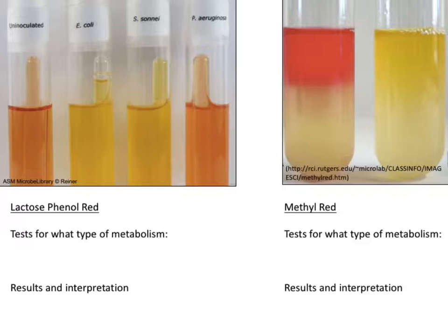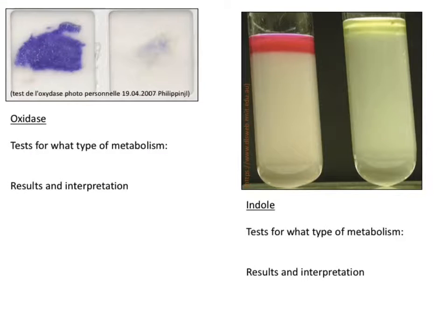Which test was positive for indole? The red one is positive, and the one in the yellow was non-reactive. Thanks for asking that one, Mike. Any other questions?